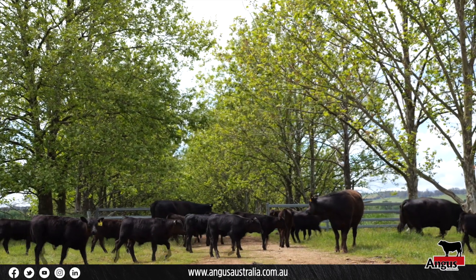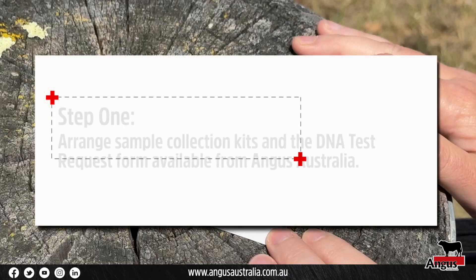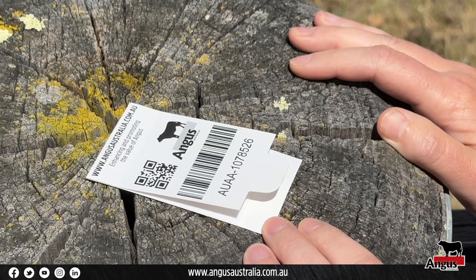Collecting tail hair DNA samples is an easy process. Firstly, obtain hair collection cards. These can be obtained through your genotyping company of choice, Zoetis or Neogen, or through Angus Australia.